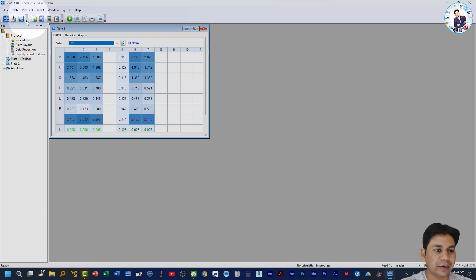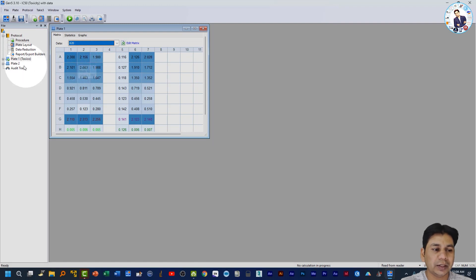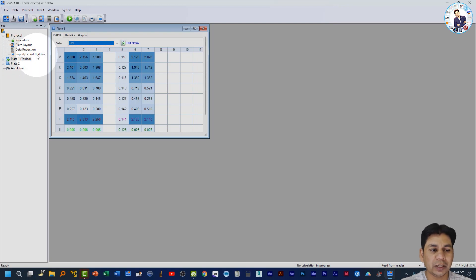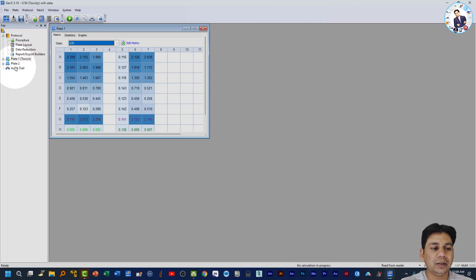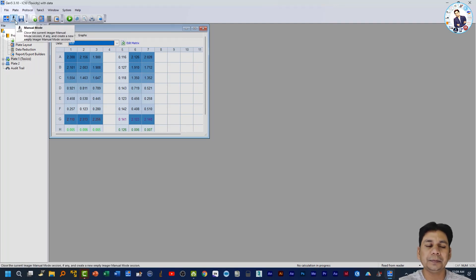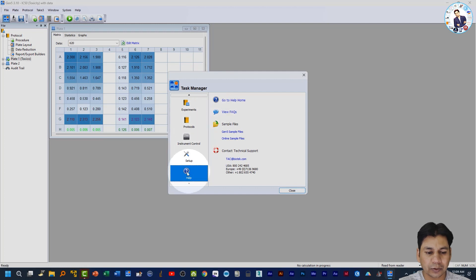In the case of an experiment file, the protocol along with the plate is present, and data is also present in Plate 1. The protocol steps — Procedure, Plate Layout, Data Reduction, Report, and Export Builder — are also present in the protocol. Along with the protocol, the plate is also here.